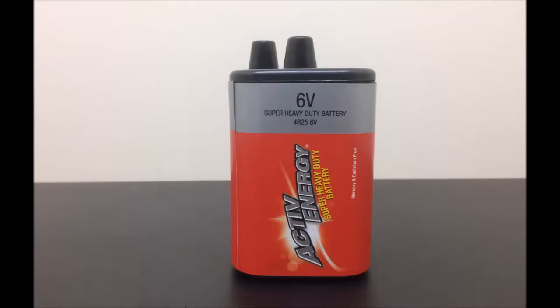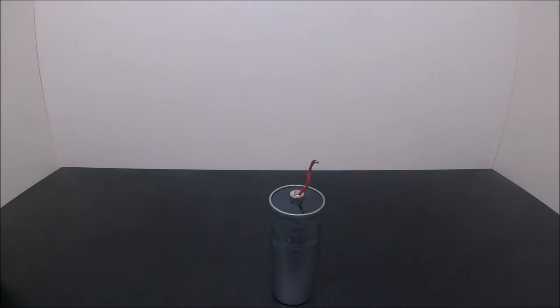Today we will have a look at how to obtain manganese dioxide from a 6-volt zinc carbon battery, which can be easily bought from a supermarket. Manganese dioxide is a very useful chemical for amateur labs.